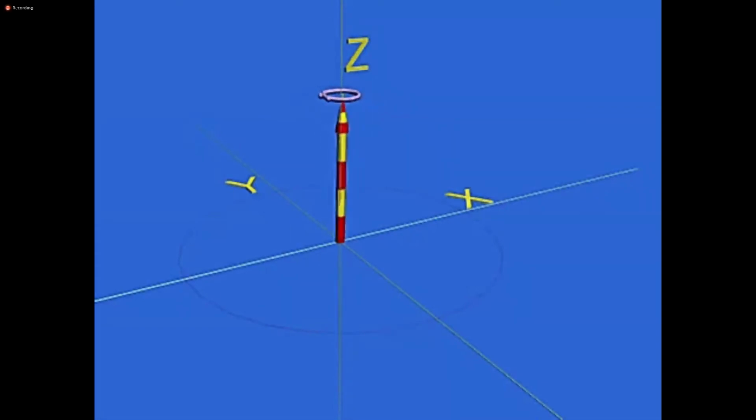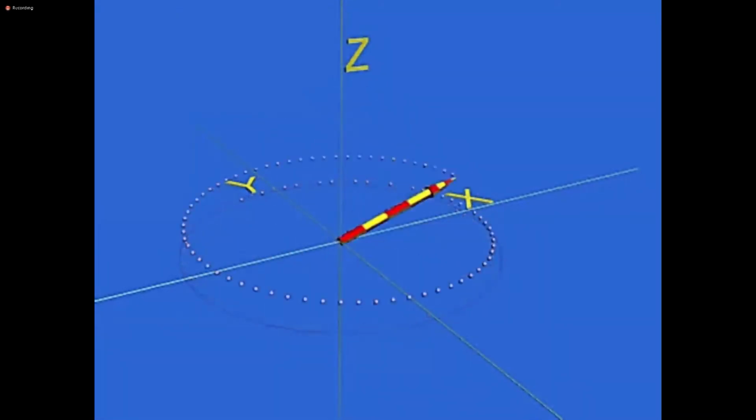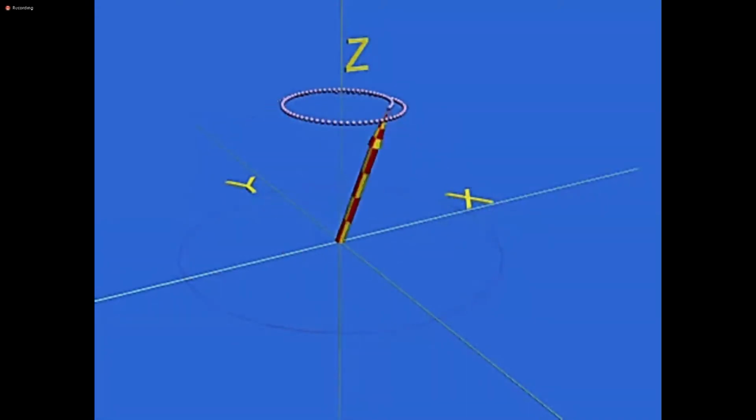Let us watch this again. We have the net magnetization, which is precessing. We applied an RF pulse, we flipped it, and then it starts to recover.